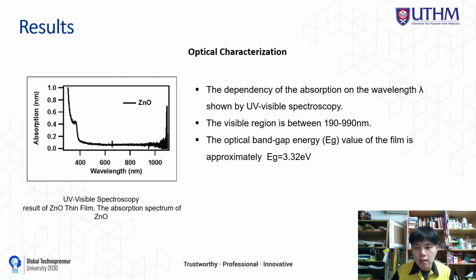The optical band gap energy value of the film is approximately 3.32 eV. This is the result found with UV-visible spectroscopy.